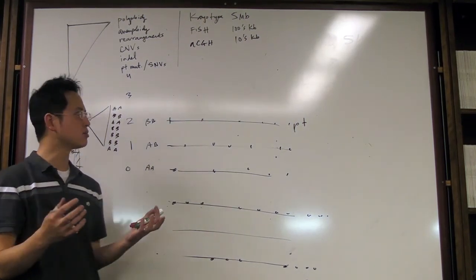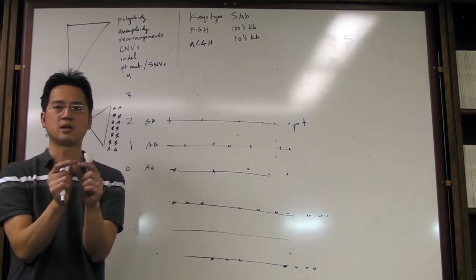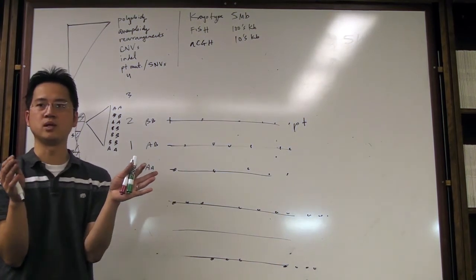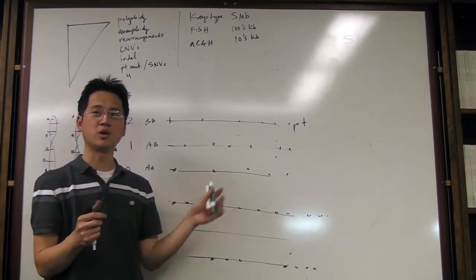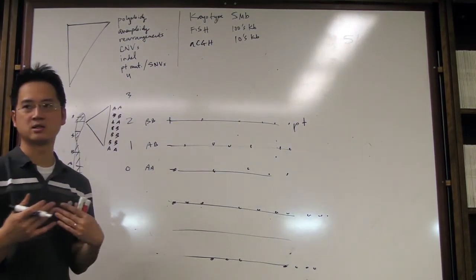So you can probably sometimes see a short stretch, maybe 3 million, 4 million bases, that looks like a loss of heterozygosity or UPD. But it also depends on the resolution, right? Because we only have 60,000 SNP probes. The resolution is not very high to pick this up.